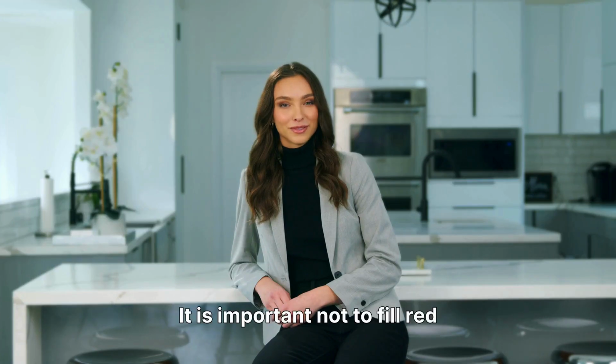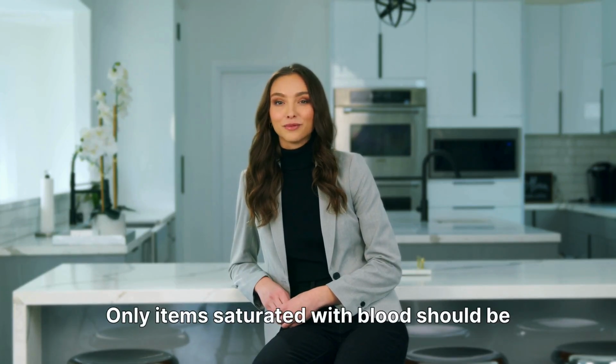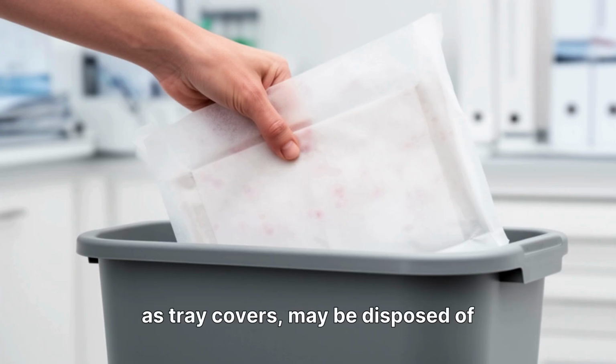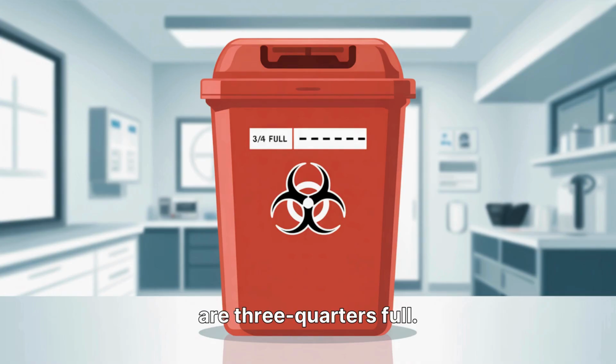Proper disposal. It is important not to fill red bags with unnecessary items. Only items saturated with blood should be placed here. Items that are only lightly stained, such as tray covers, may be disposed of in regular trash. Sharps containers should be sealed when they are 3/4 full.